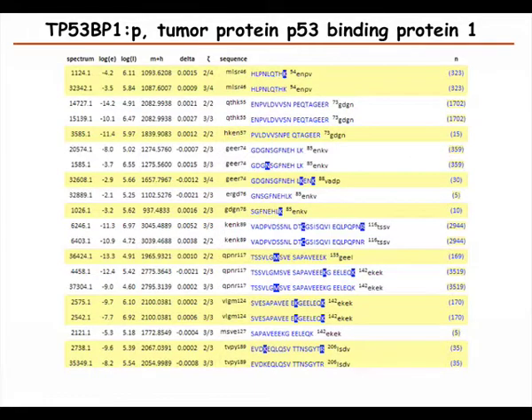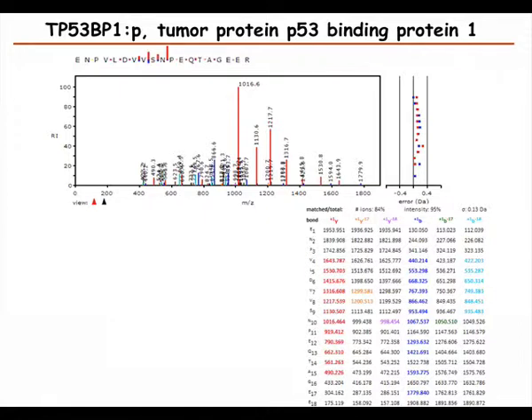So then we can go down one level more to see the list of peptides, and then again down also to the spectrum level. So this can be done for all these identifications. They're available on the website, for 300,000 experiments, for a few million different mzML spectra.